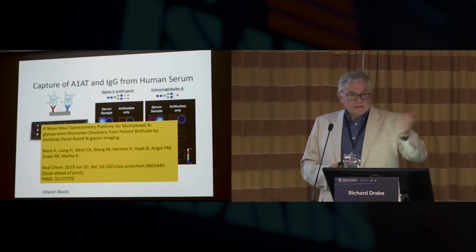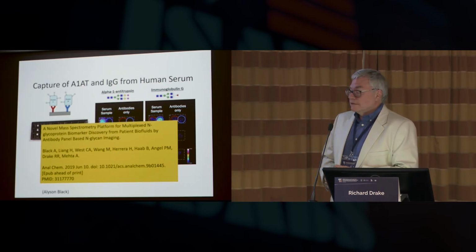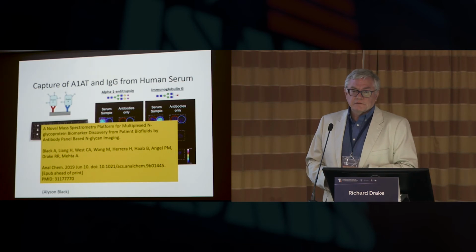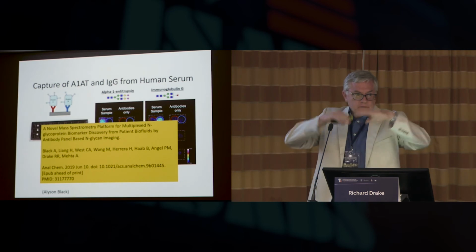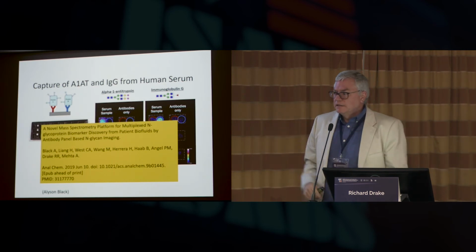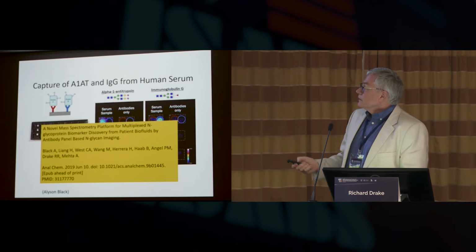The kind of slide Monford showed, with let's say the top 20 or 30 serum glycoproteins, we're going to easily get this on and essentially glycoprofile each one of those samples, and start doing that sort of amazing calculation of how each individual glycoprotein is changing with a disease state.